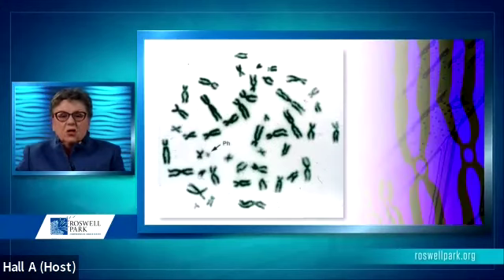Let's start at the beginning. Watson and Crick, April 25th, 1953: the structure of DNA was established. Not long after that, in 1956, we established the correct number of chromosomes, that's 46. This is basically what our material looked like in the early 60s.